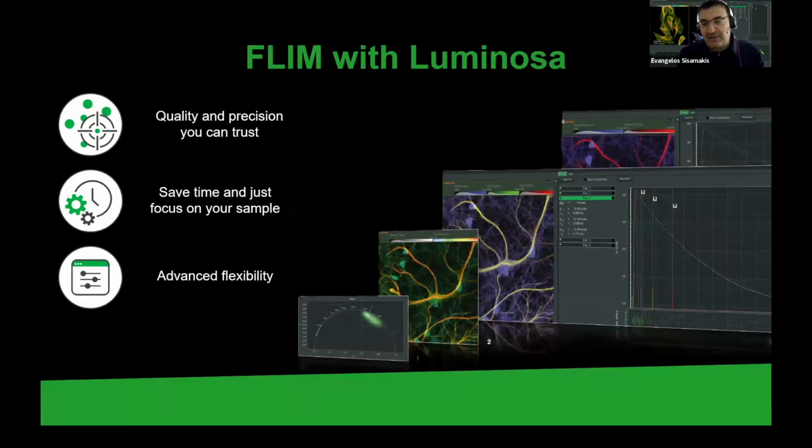But in this talk, I will not focus on the other parts of Luminosa, like single molecule FRET and FCS. I will focus on FLIM, and give you an idea of how we push the boundaries of confocal FLIM in different directions. So first, we're talking about being more quantitative and more reproducible than ever before.